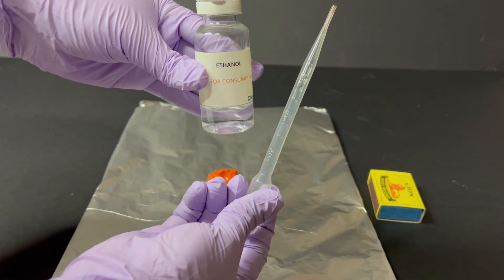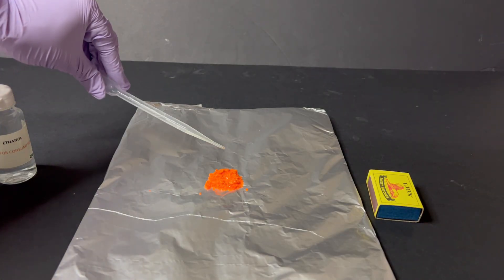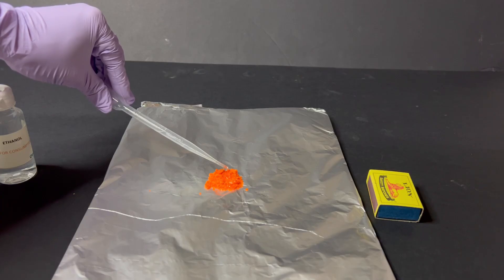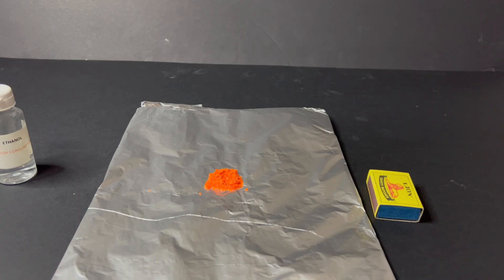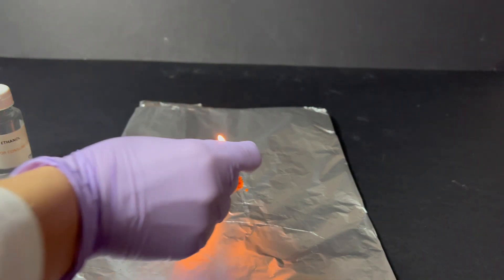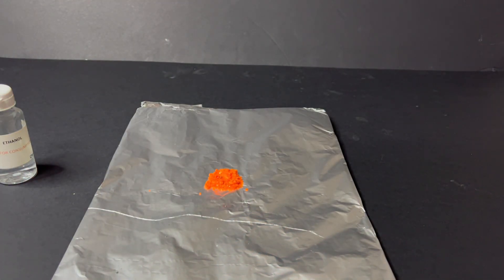I now add a few drops of ethanol into the hollow and light it carefully. The ethanol starts burning, providing the heat needed for the decomposition reaction to begin.